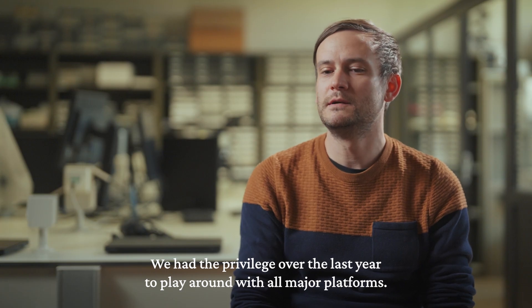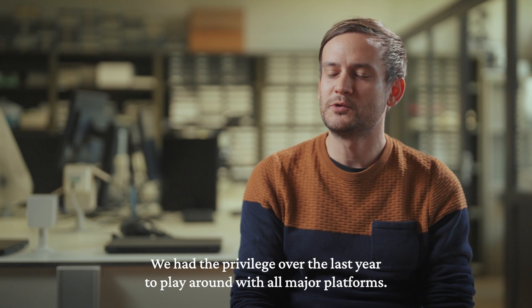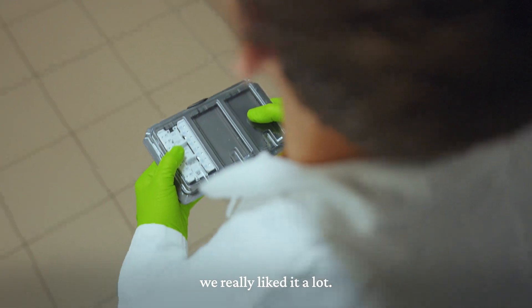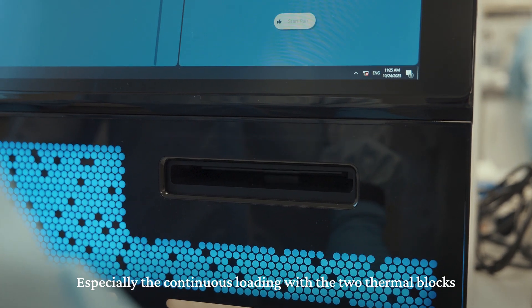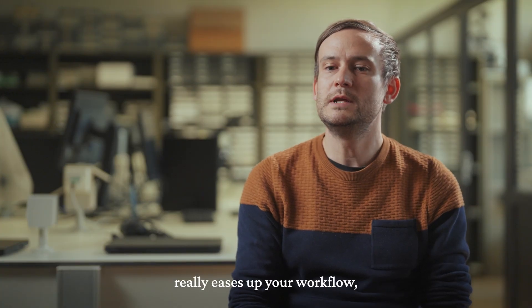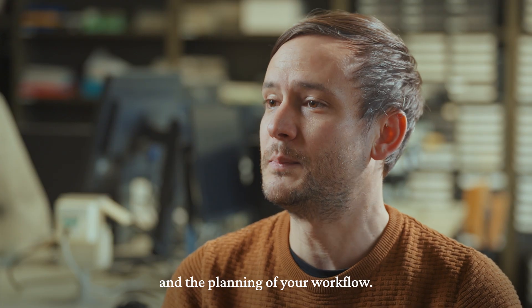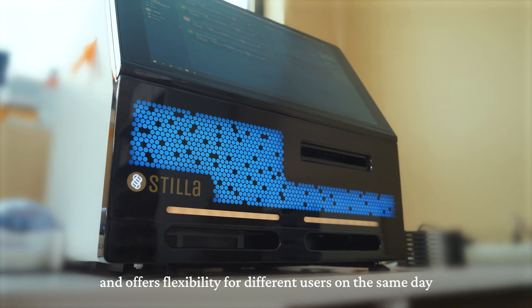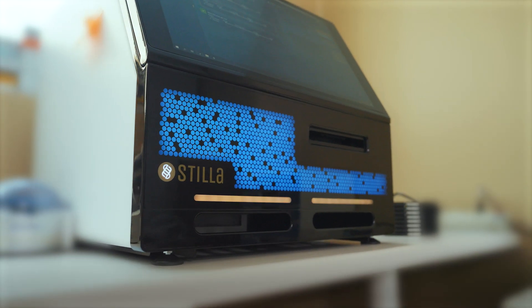We had the privilege over the last year to play around with all major platforms. I must say in the three days that we tested out the Nio, we really liked it a lot — especially the continuous loading with the two thermal blocks really eases up your workflow and the planning of your workflow. So it's a machine that actually works together with you and offers flexibility for different users on the same day to run experiments.